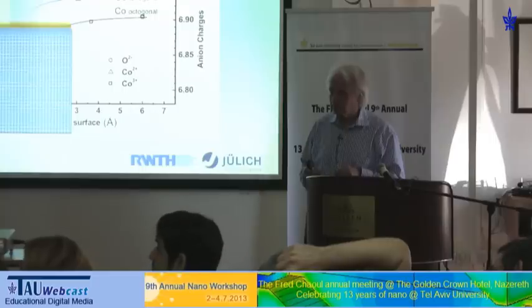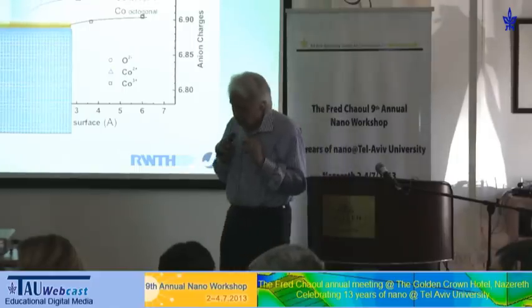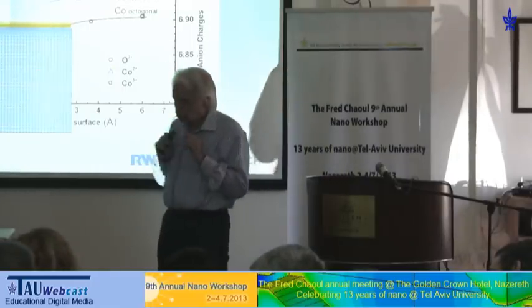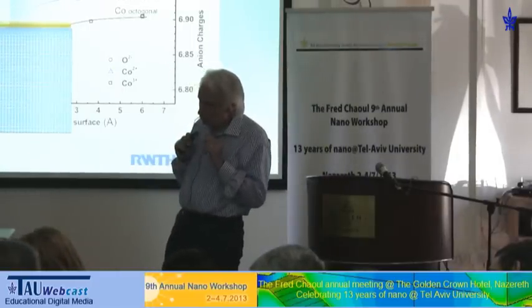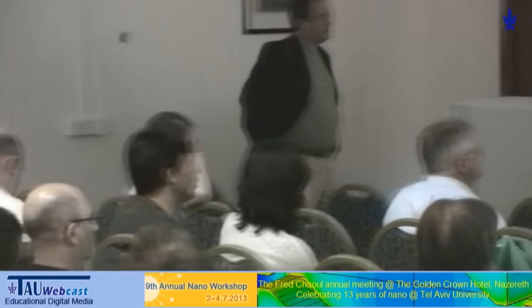Yes, about the yttrium, barium, copper, oxygen junctions, Josephson junctions. Can you tell us how the TEM work helped you optimize the junctions, or is it just for understanding the mechanism of the Josephson junction?